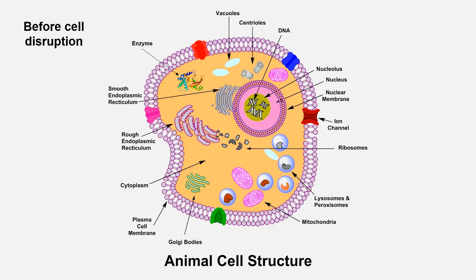So, the reason behind opening the cell is to release the interesting molecules. In other words, cell disruption or cell opening is a biological process to release the intracellular molecules from inside the cell.